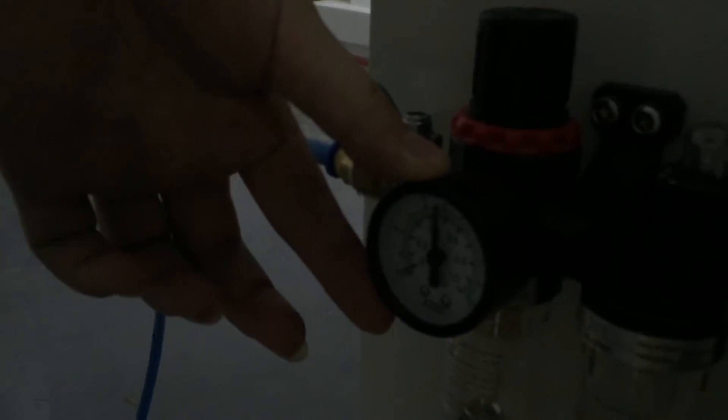And open this switch, adjust the switch until the pressure gauge reads about 0.6 kg.